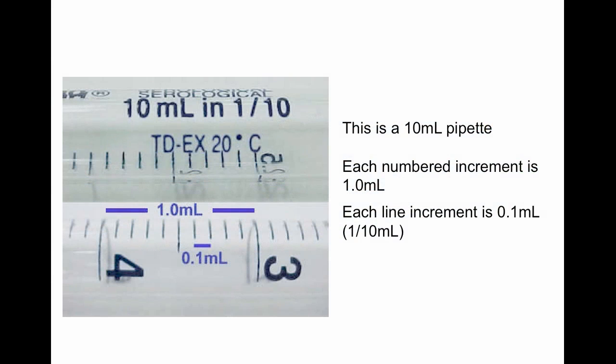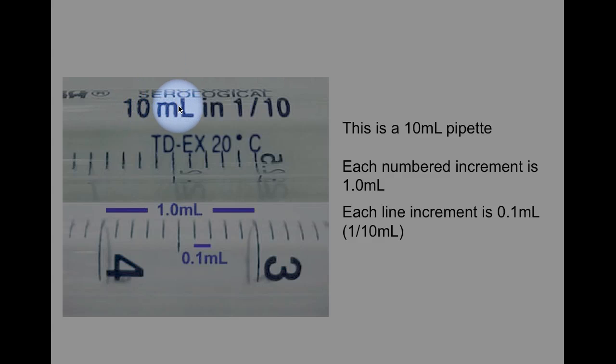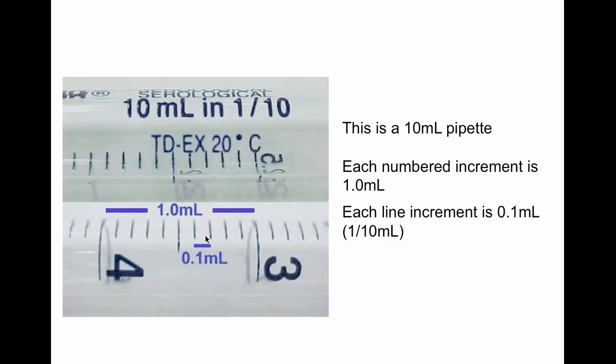This is a pretty typical one. This is a 10 ml pipet and as you can see, this is going to tell you what the maximum volume is that you can dispense and it tells you what the increments are. This means total delivered volume and it is calibrated at 20 degrees Celsius. So each numbered increment, for example, between the 4 and the 3, this is 1 ml. And then each line increment, these little lines, that's a tenth of a milliliter.